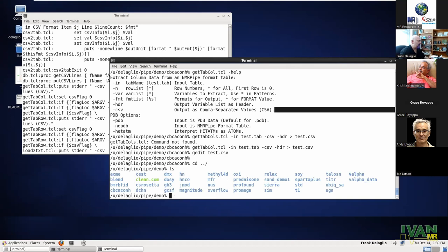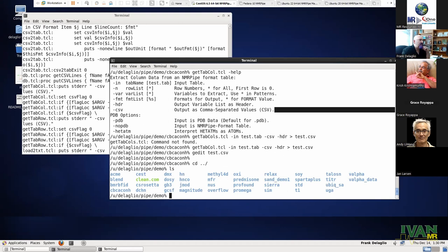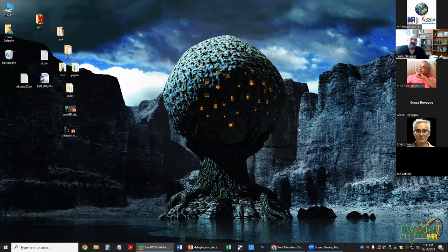Frank, this is Krish. Yes. I have a question which may be a little bit offline for this discussion, but your description of SMILE made me sit up. I have been exclusively using IST. So do you want to give some idea of do's and don'ts, of preference of one over the other?